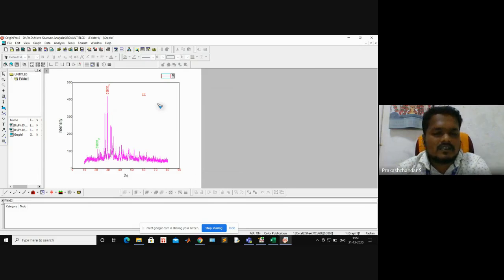So this, thank you. This is a small tutorial on how to draw XRD graphs.